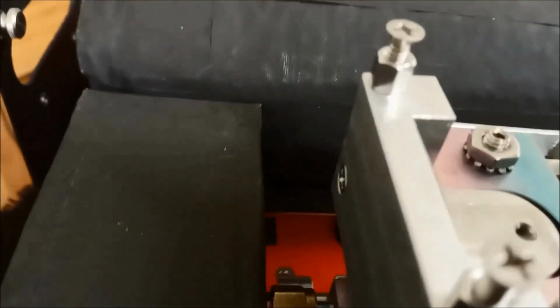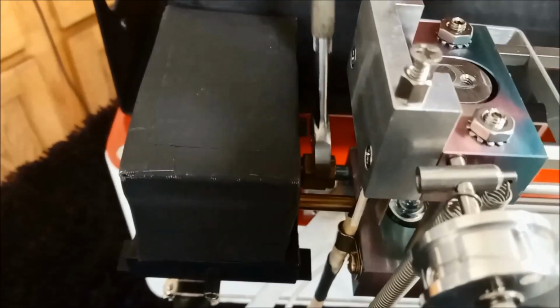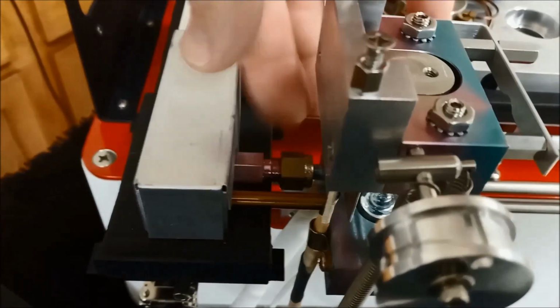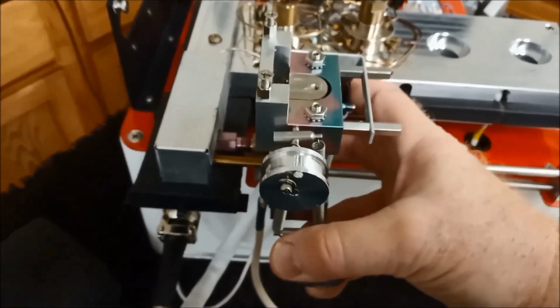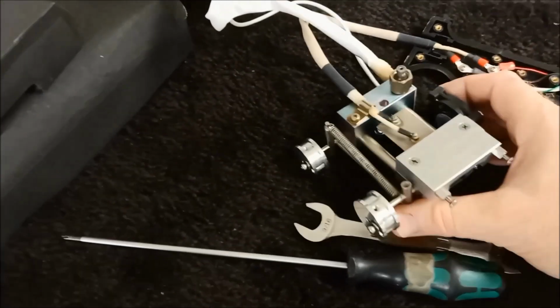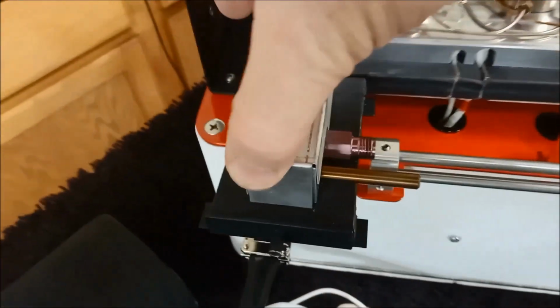On the disc itself, it connects to the valve oven. At this 1/4 inch nut, so we can remove this. Needless to say, at this point, the valve oven should be cool. Once I loosen that, I should be able to take the whole disc, slide it forward, and it will come off.